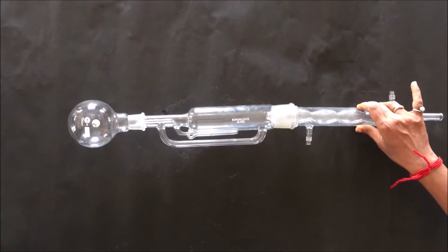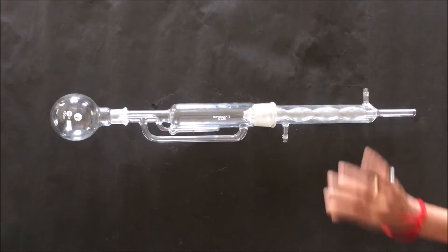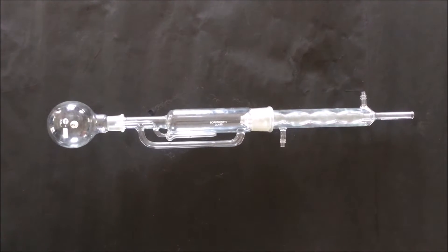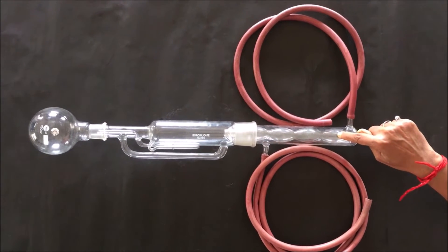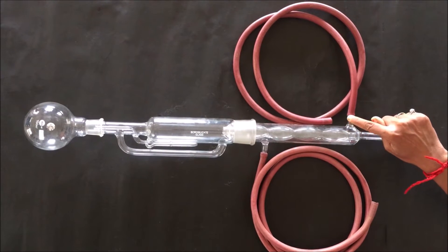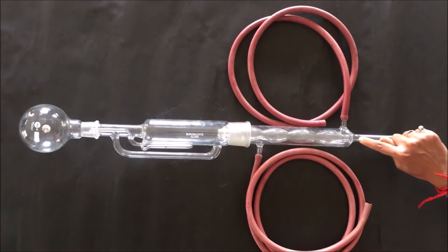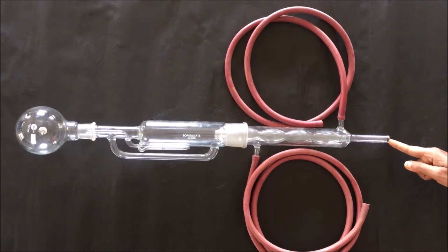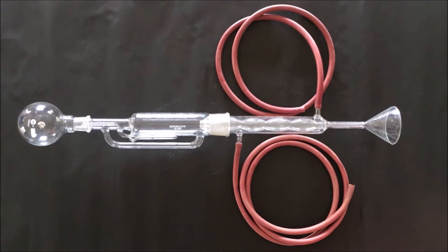Now attach the condenser to the Soxhlet extraction chamber through the joints. Then attach two separate pipes at the inlet and outlet for water. Through the inlet pipe cold water goes inside the condenser and hot water comes out from the condenser through the outlet pipe. This is the tube through which we add the solvent using a funnel. These are the complete parts of the Soxhlet apparatus assembled in a systematic way.